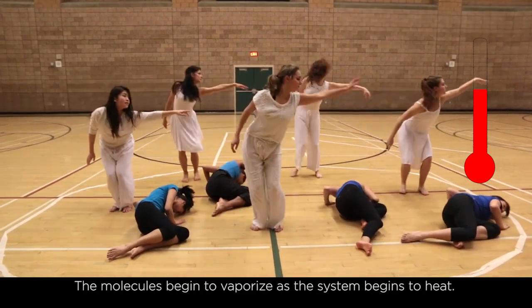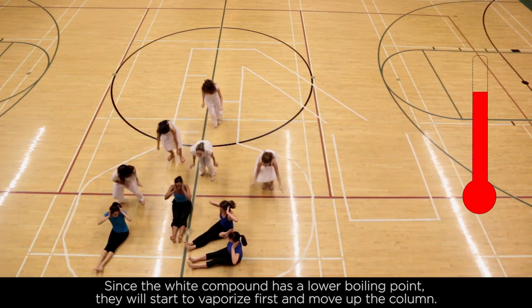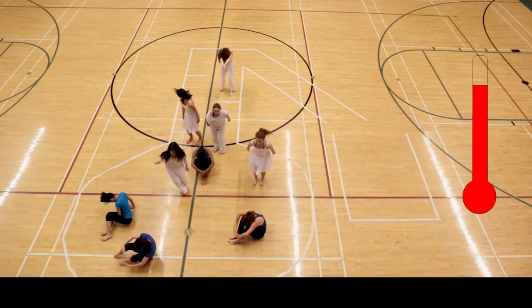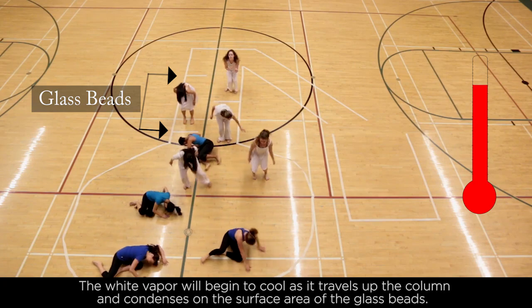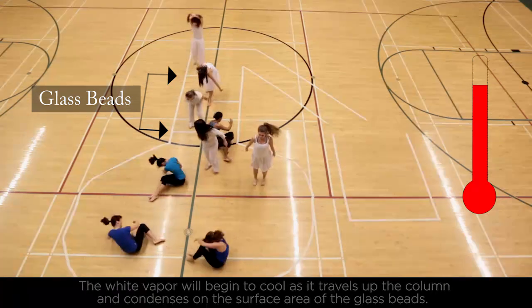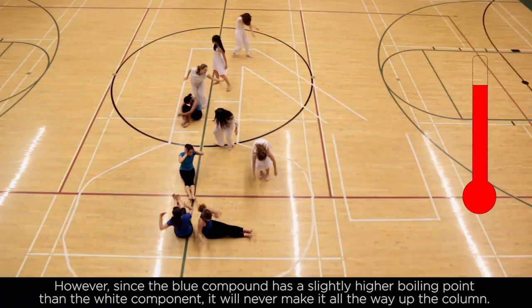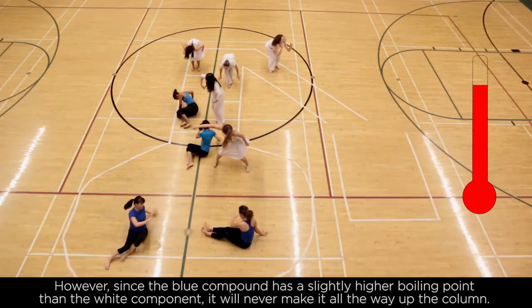The molecules begin to vaporize as the system begins to heat. Since the white compound has a lower boiling point, it will start to vaporize first and move up the column. The white vapor will begin to cool as it travels up the column and condenses on the surface area of the glass beads. Some of the blue component will begin to vaporize with the white component; however, since the blue compound has a slightly higher boiling point, it will never make it all the way up the column.